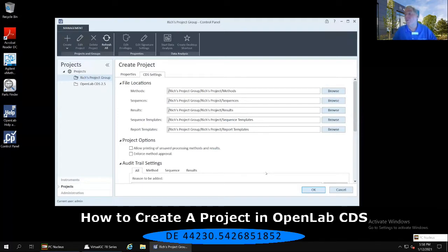So then a logical question will be, well, why the heck is that browse key available? Well, unfortunately, it's been an ongoing discussion with R&D. We have asked them to remove those browse keys or at least make them gray, but they have said that in the future, they will be available, so they didn't want to have to change the code in the future. Again, a little bit of a disagreement between those of us out in the field and our R&D colleagues.